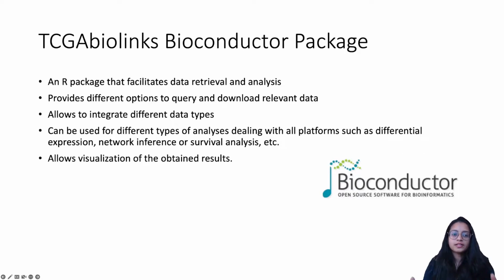Talking about the TCGAbiolinks Bioconductor package, it is a package that not only allows us to perform data retrieval, but also allows us to build a query and integrate different data types. In addition to that, it can also allow us to perform analyses like differential expression, network analysis, or survival analysis on the retrieved data. And we can also visualize data using this package.